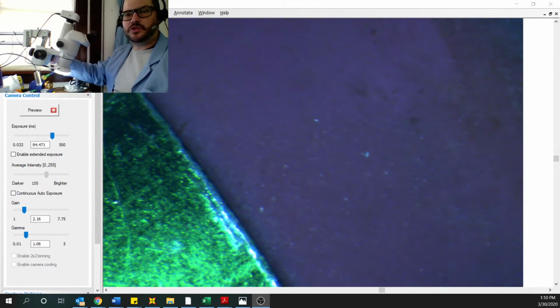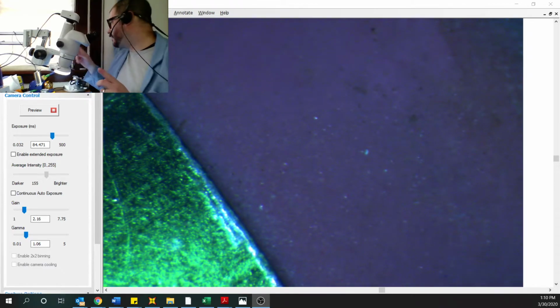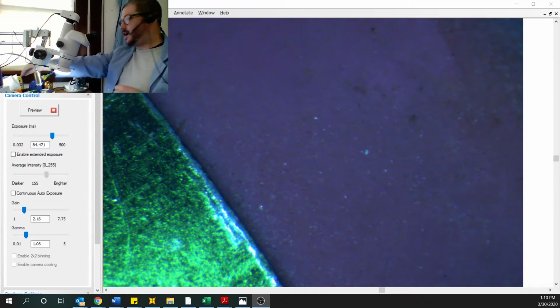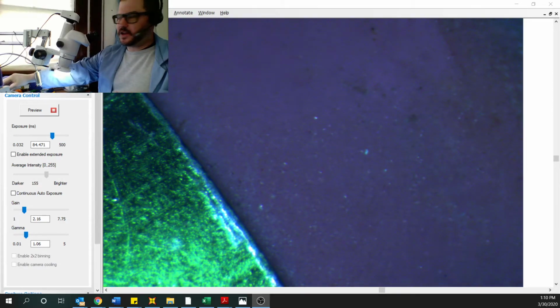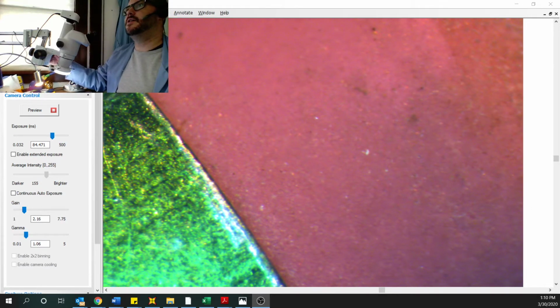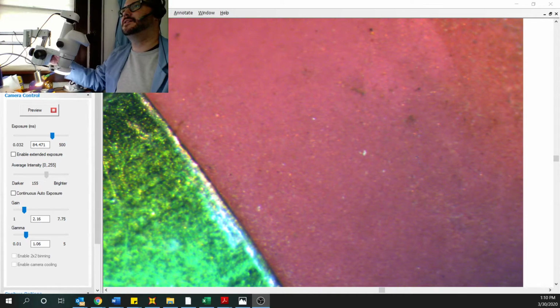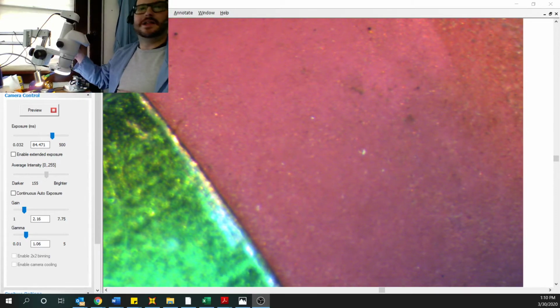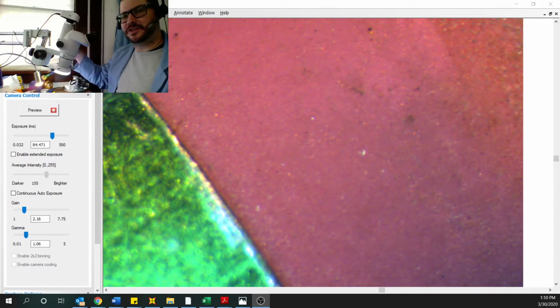Now, as I start to zoom in a little bit more each and every time, we're currently looking at 50x magnification. This is as strong as it gets. I'm going to turn on another light that I've got on here, so we can catch a little bit more of the bright. Wow, look at that, huh? That's pretty cool. That's the pencil eraser is what that is.